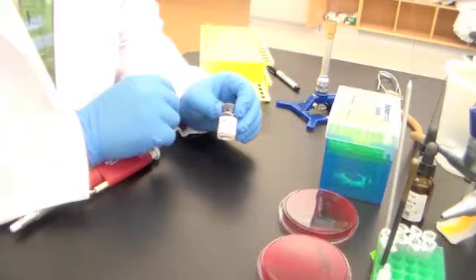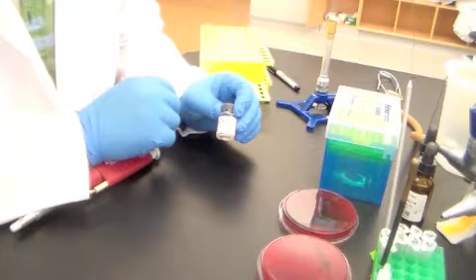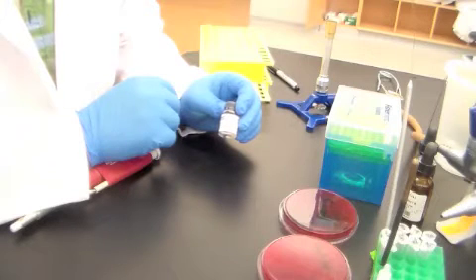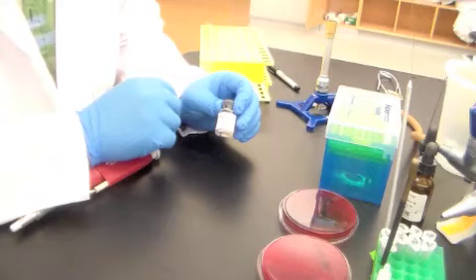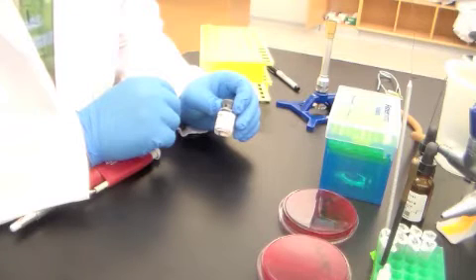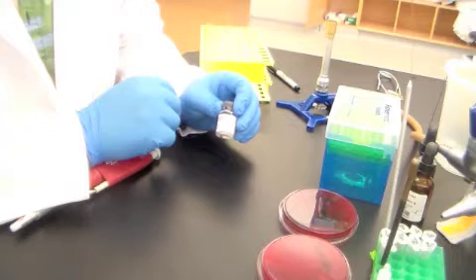So it's important that we always use plasma in coagulase, because what we're actually assaying for is the ability of the bacterium to form a clot. Virulent staphylococci possess on their surface, and to some degree a secreted enzyme called coagulase, which is capable of triggering the clotting cascade in much the same way that we trigger the clotting cascade.